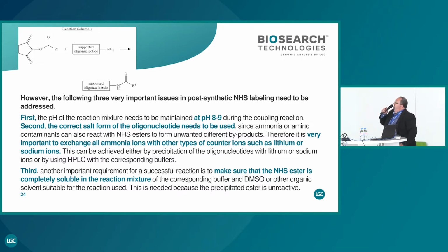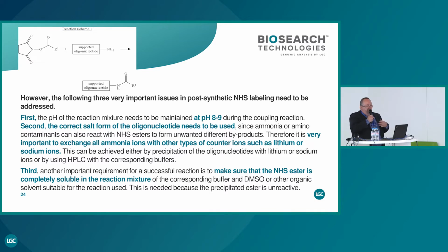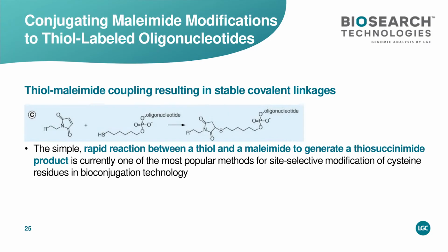And the first thing, it's normal because if you do chemistry, it's always the same. You need to be sure that your NHS ester is soluble in your reaction mixture. If not, it will not work. Of course, it's chemistry, but when you start a new lab, it's maybe things you don't think about. Here we are speaking about people making a new laboratory. They don't know it. But sometimes, oh, why? I mixed it with this. It's not working. Of course, there is no contact.